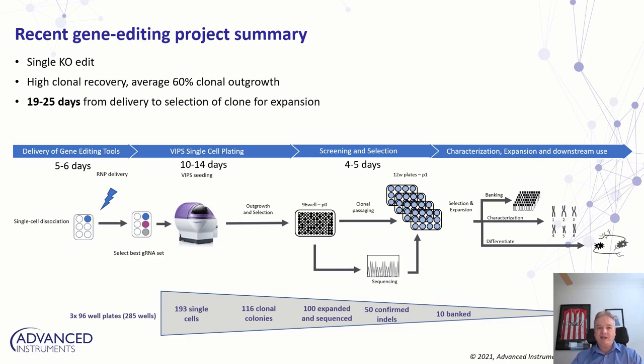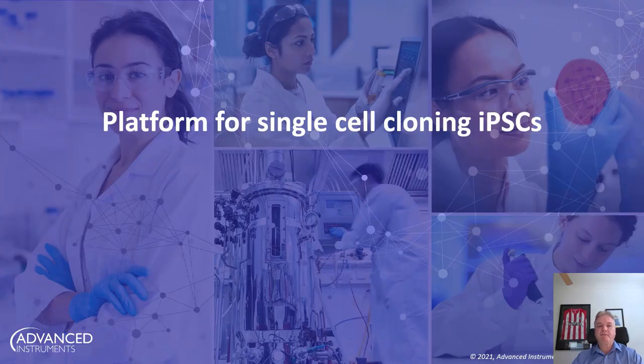But also look at this funnel down at the bottom. This gives you a sense of the number of plates, input clones you need to do with a gene editing project, and the various triaging at the different steps of clonality, expanding, and then confirming with sequencing or genotyping the particular edit is in place, and then banking down the clones of choice.